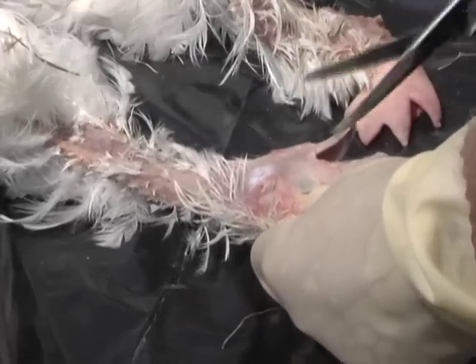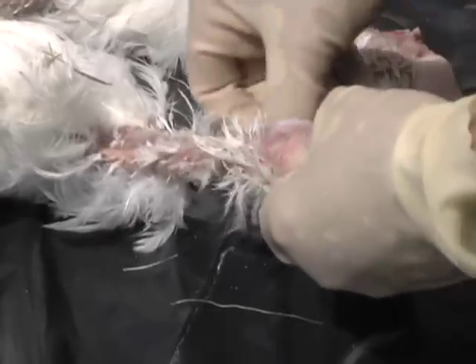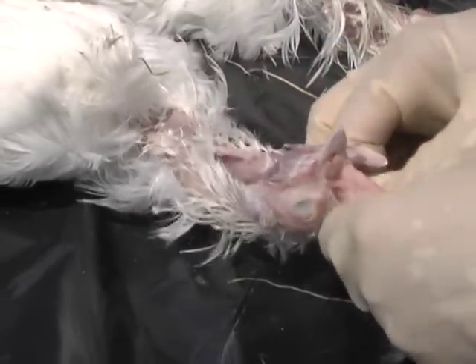Insert scissors into the mouth at the angle of the beak and cut the mouth open. Then, using your thumb, stretch out and lengthen the cut. This allows very good exposure of the glottis and the palatine cleft.